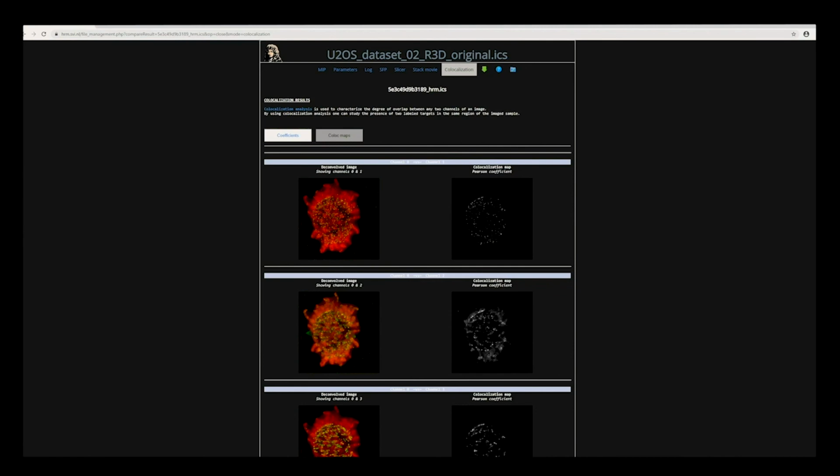I think that this is mostly what we had time for today. I think we probably still have a little bit of time to talk about OMERO, because some of you are really interested in communicating HRM with an OMERO server.